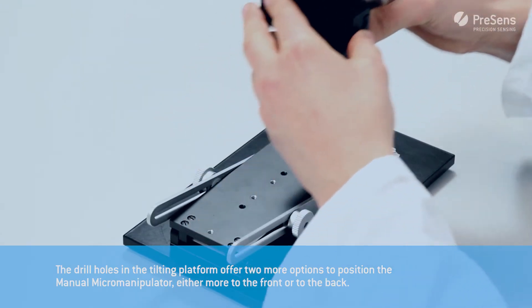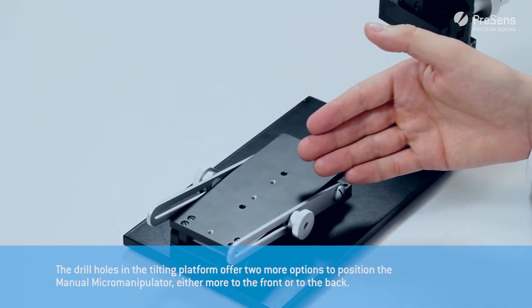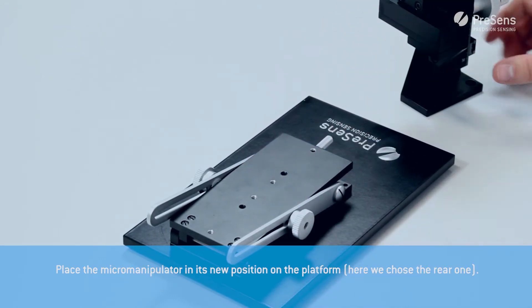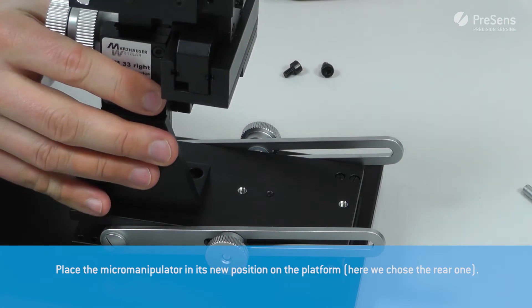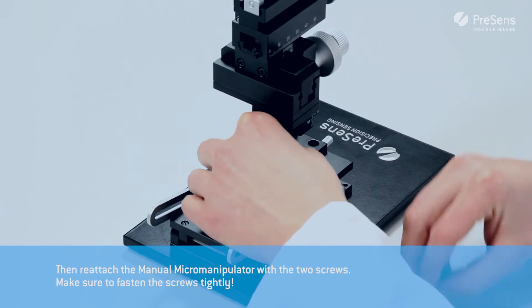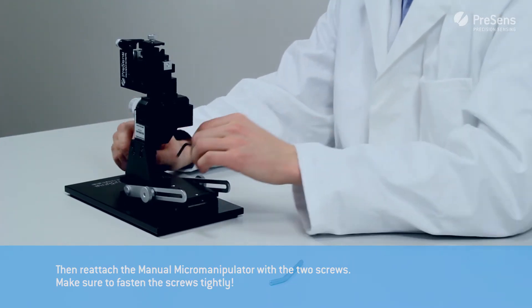The drill holes in the tilting platform offer two more options to position the manual micromanipulator, either more to the front or to the back. Place the micromanipulator in its new position on the platform — here we chose the rear one. Then reattach the manual micromanipulator with the two screws and make sure to fasten them tightly.